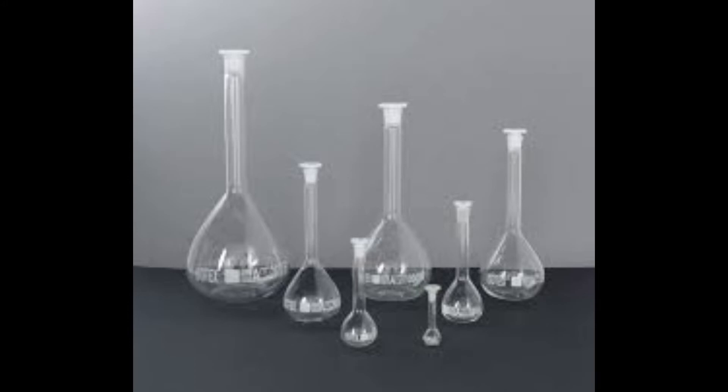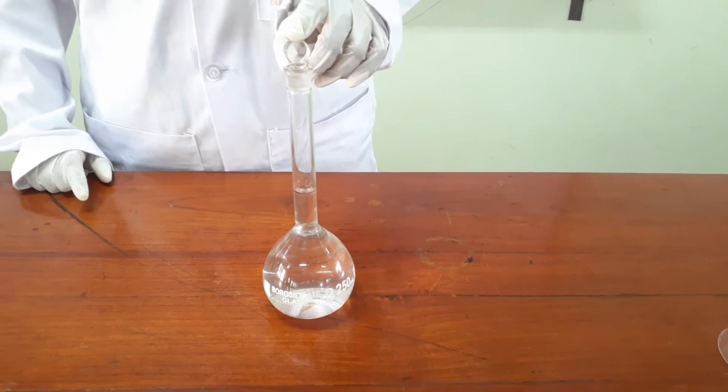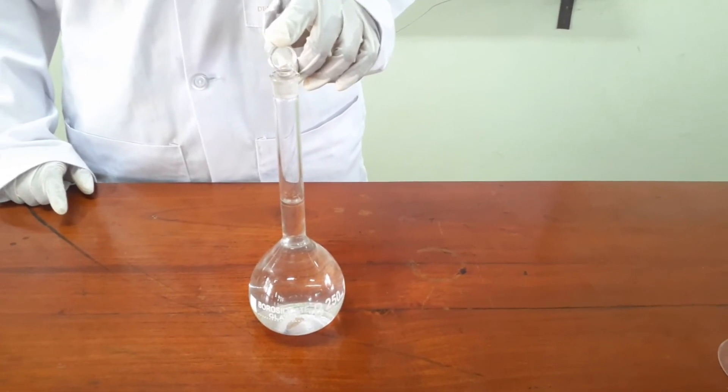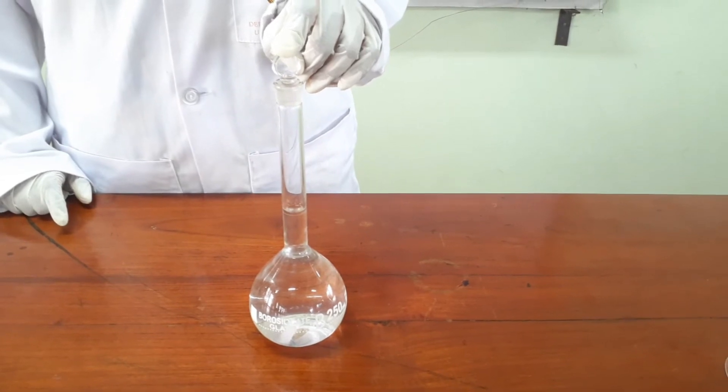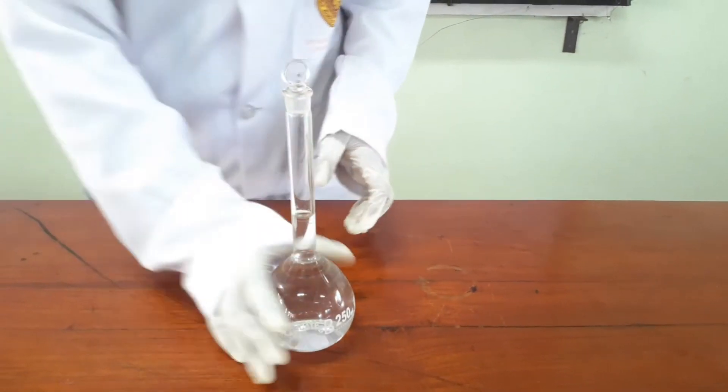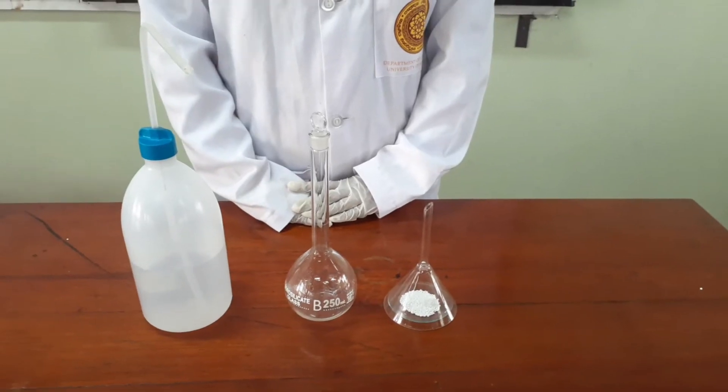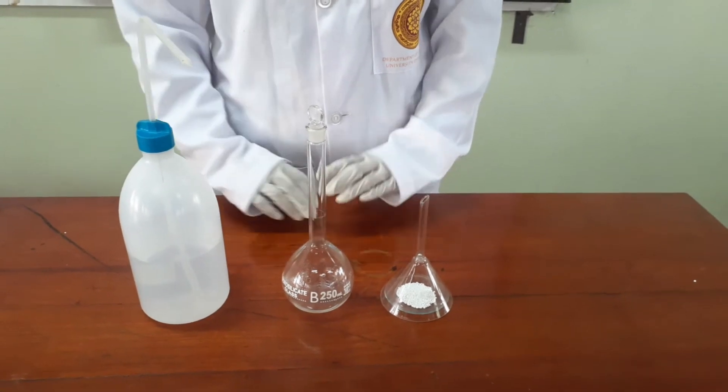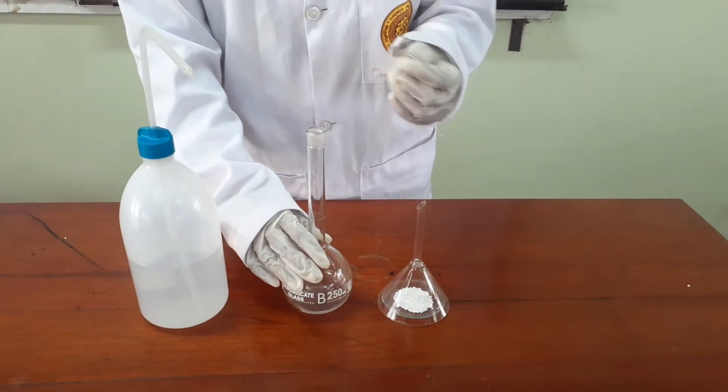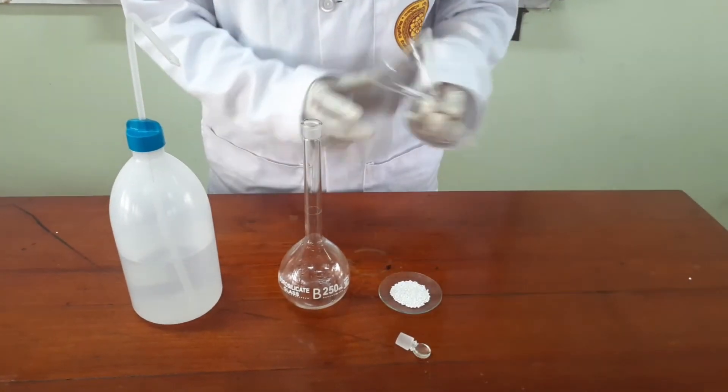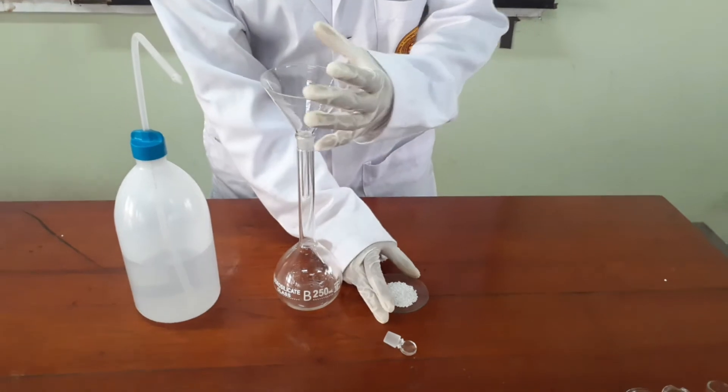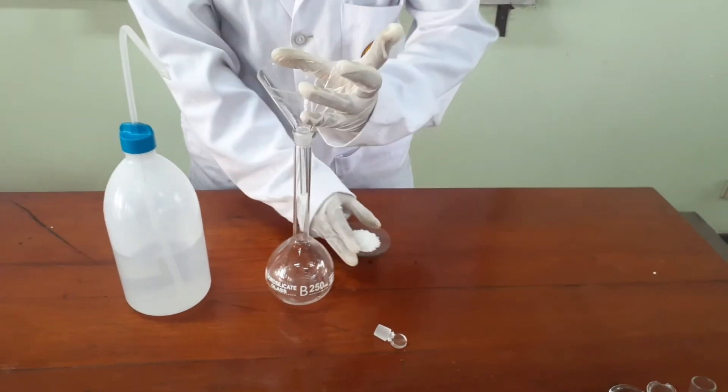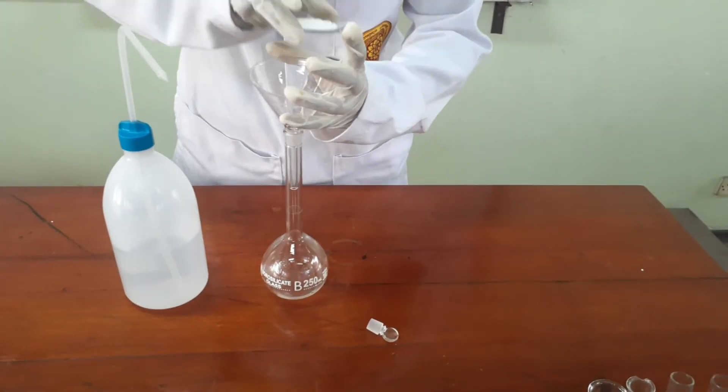We use volumetric flask to measure volumes very precisely, and we mainly use them to prepare a known solution with accurate concentration. Let's see how to prepare a solution sample. First, uncap the volumetric flask and then keep the funnel on the volumetric flask and add the solid sample into the volumetric flask.